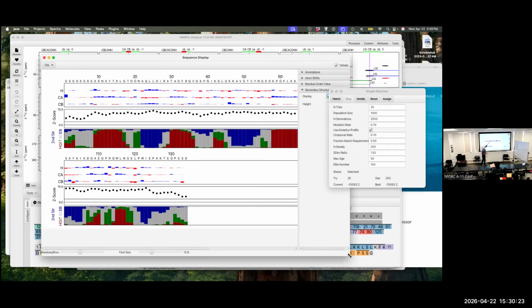Red is helix. There was some time before to clean up those clusters and process the data sets, but we saw that pretty quickly. So fairly quickly with good quality data, which this is, we can go from raw data to assignments to something about secondary structure.